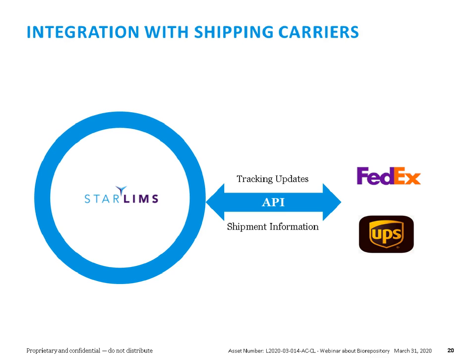This could be very useful also for laboratories when they do shipments of samples from internal sites, different locations that a laboratory could have, but you want to track when it made it to the destination, to the other internal site of the laboratory.